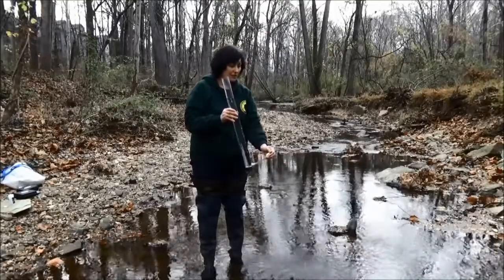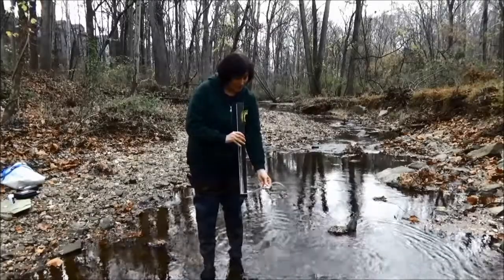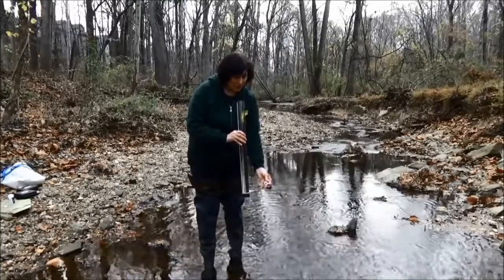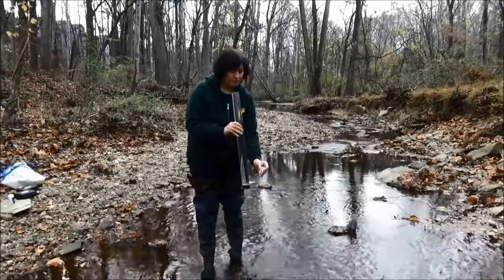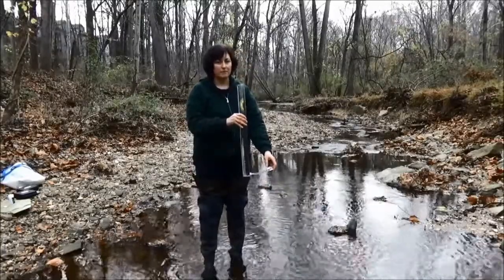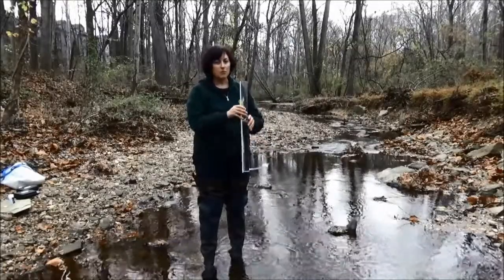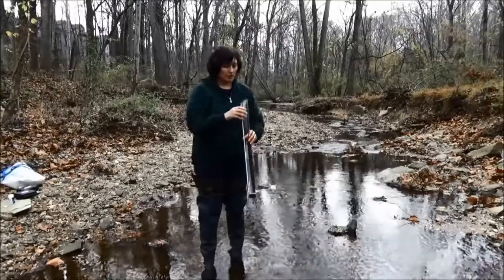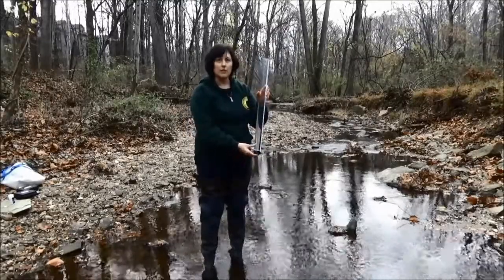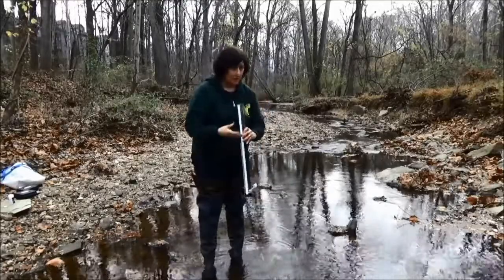So you release your water and look down, and when you get to the level where you can see clearly, go ahead and close that valve again and take your reading. It's important to look straight down the tube, because it's going to look a lot different than looking from the side — it's always going to look more clear from the side than straight down.